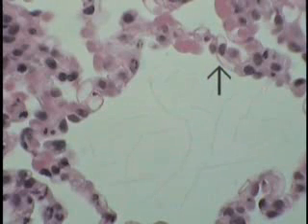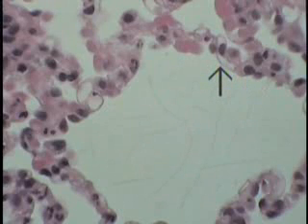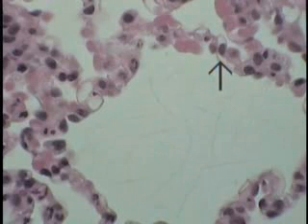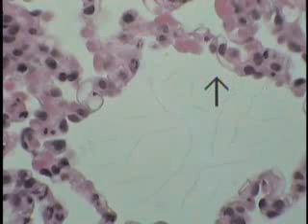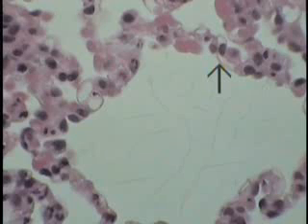This is the blood-air barrier, and it's going to consist of an overlying type 1 epithelial pneumocyte, or the cytoplasm thereof. In between the two will be a basement membrane, and also forming this little thin hair-like membrane, of course, will be the endothelial cytoplasm. The nucleus of the endothelial cell is shown here, as indicated by the pointer. So this illustrates the thinness of that blood-air barrier where this exchange of gases is occurring.